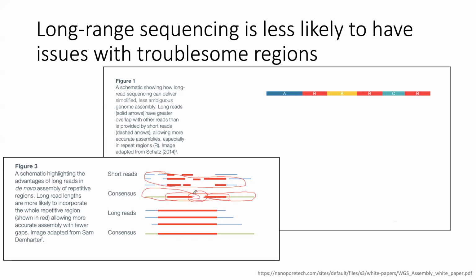and this region of the sequence would be a contig here. When you do long read sequencing, it extends the length of the problem region, so it completely covers it. It suddenly isn't a problem region anymore.